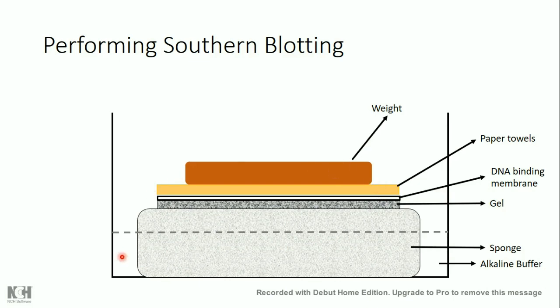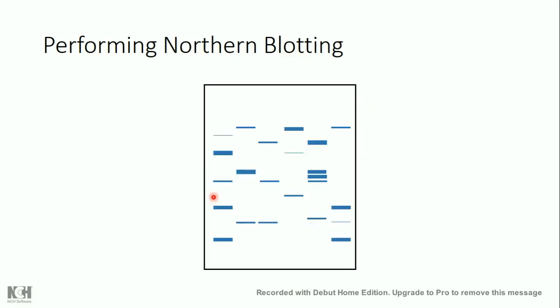Similarly, the capillary forces are going to drive the water from the area of high water pressure to the area of low water pressure, and then the RNA sequences are going to stick on the membrane because of ion exchange forces, because the RNAs are negatively charged, and the nylon or nitrocellulose membrane is positively charged. So then I will have the RNA samples stuck on the membrane like this.